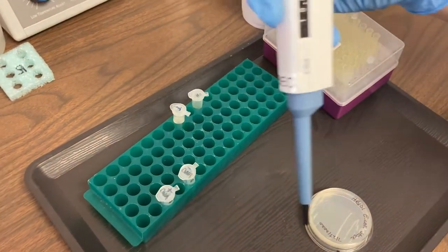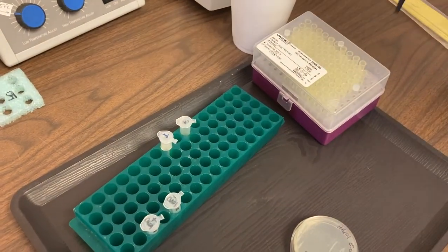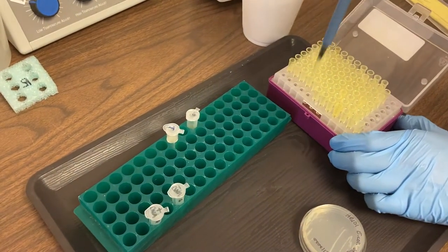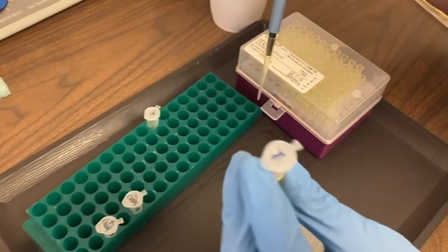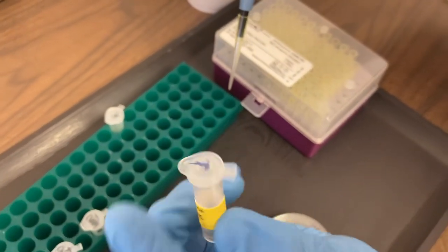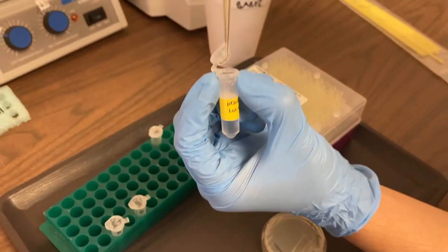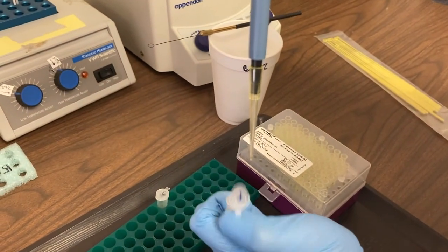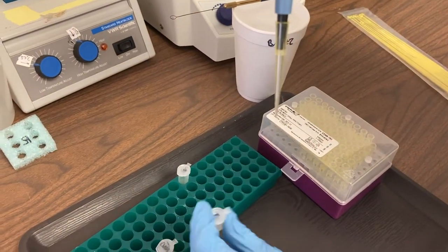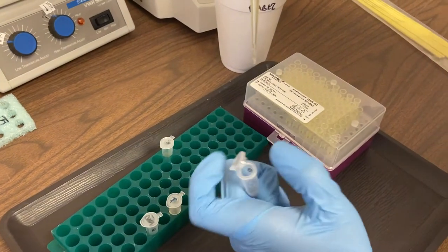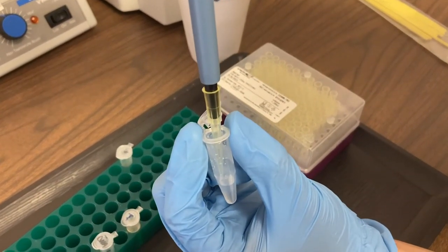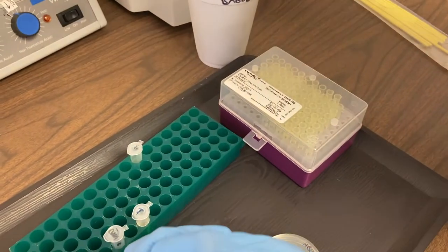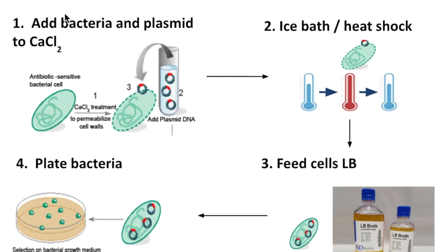So now we're ready to add our plasmid DNA. We set our micropipette to 10 microliters. We get a fresh tip on there. Here's our plasmid DNA. And we're going to add this to only one of these tubes. We're going to add it to the tube that is labeled plus DNA. So remember what we have in here right now. We have our calcium chloride, we have our bacteria, and now we have the plasmid DNA in it. So that's it for the first part of the lab.